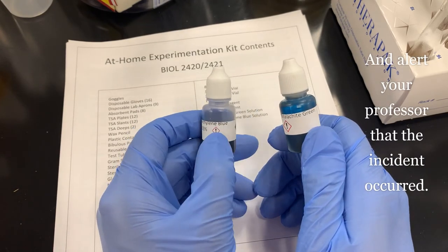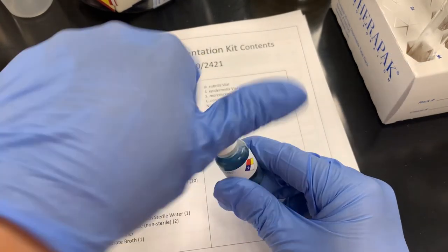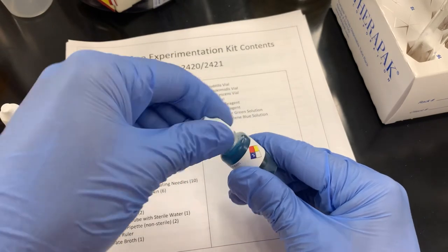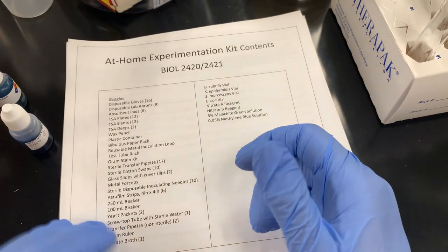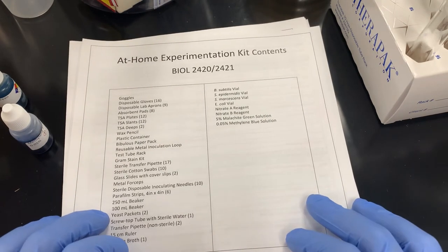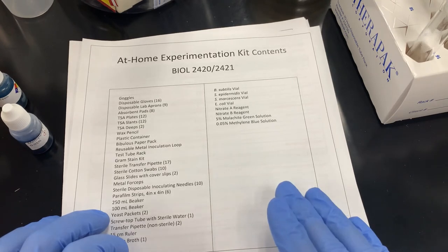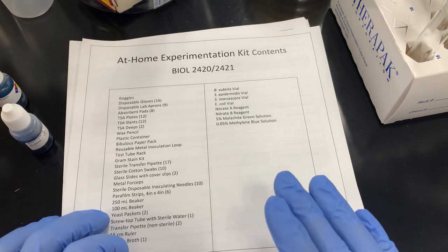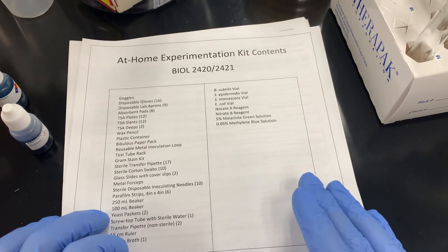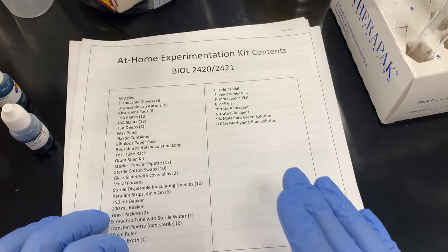These aren't overly dangerous. They are very easy to use. It's a dropper bottle, okay? We give you just enough for the malachite green to use for the spore stain, okay? If you get those on your skin, which you shouldn't because it's a dropper bottle and you're gonna be very safe with it, flush it with water, tell your instructor, make sure they know it happens.